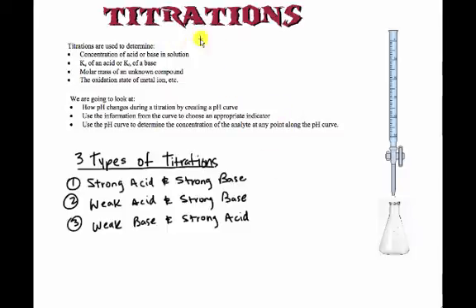At minimum, a titration is a controlled buffer system, is really what we're dealing with here. We're going to use this thing called a burette to analyze a substance. So our tool here that we use is the burette. Down here in this flask, we're going to put our substance that we're going to be measuring or analyzing.